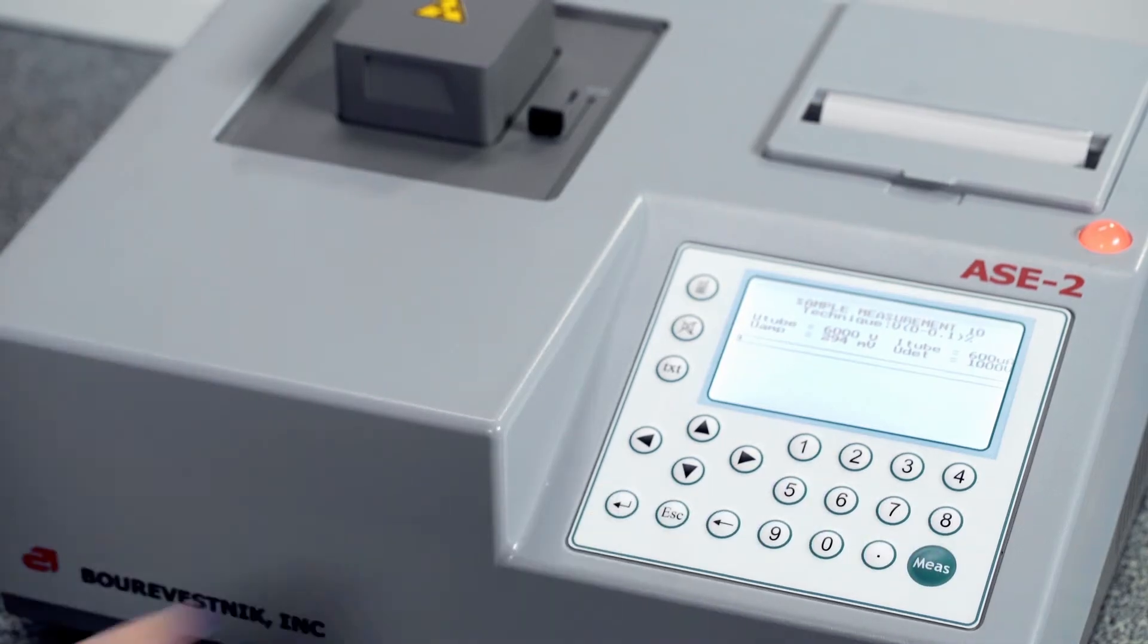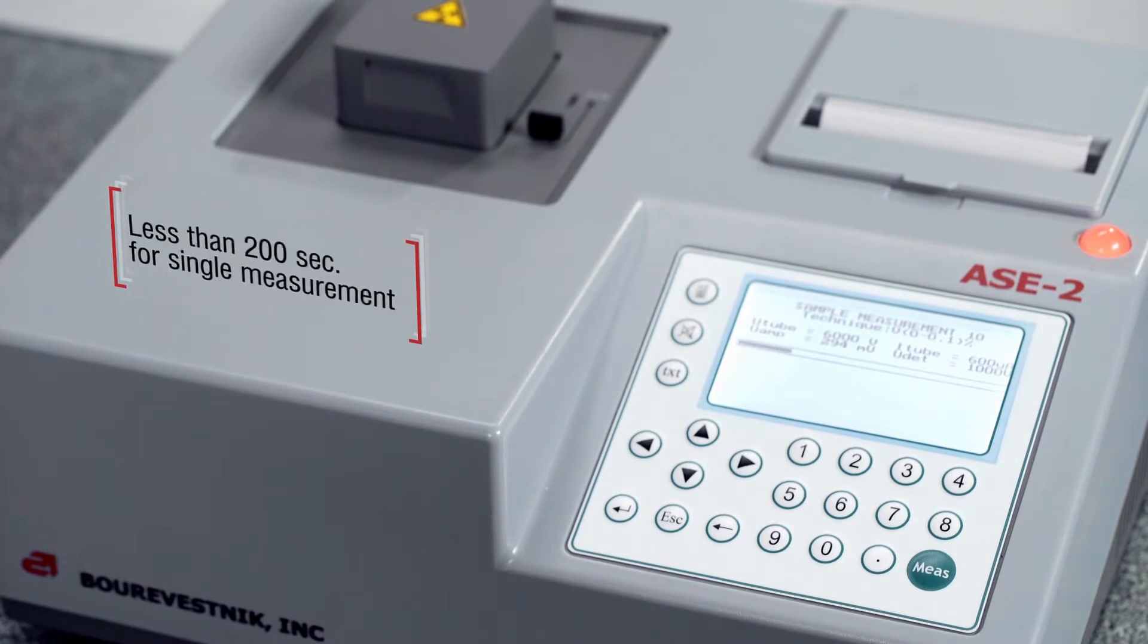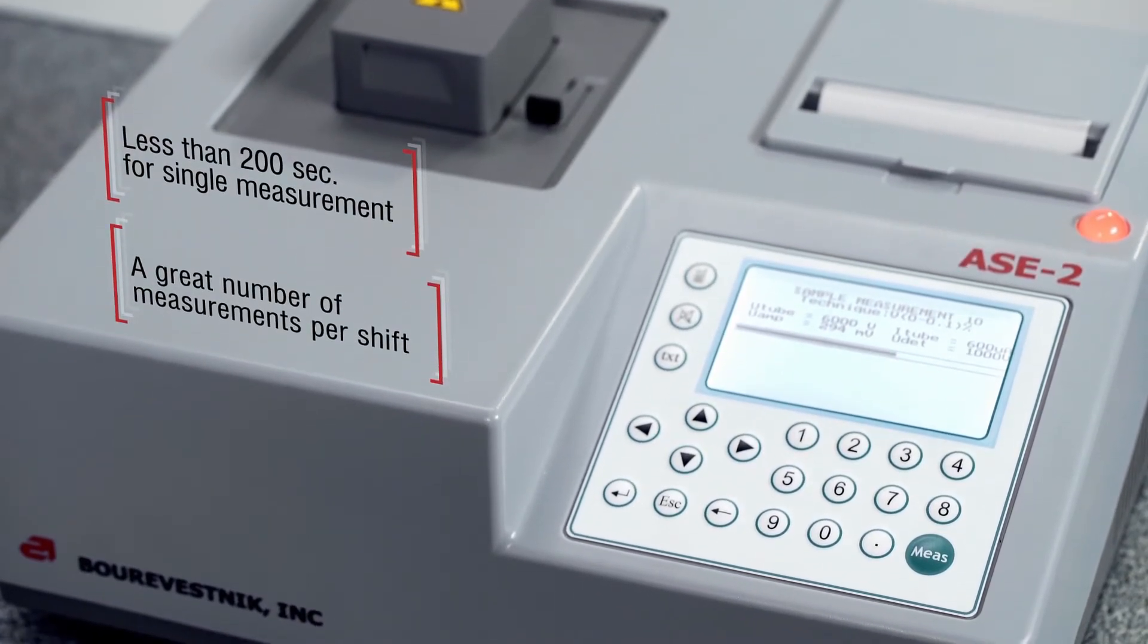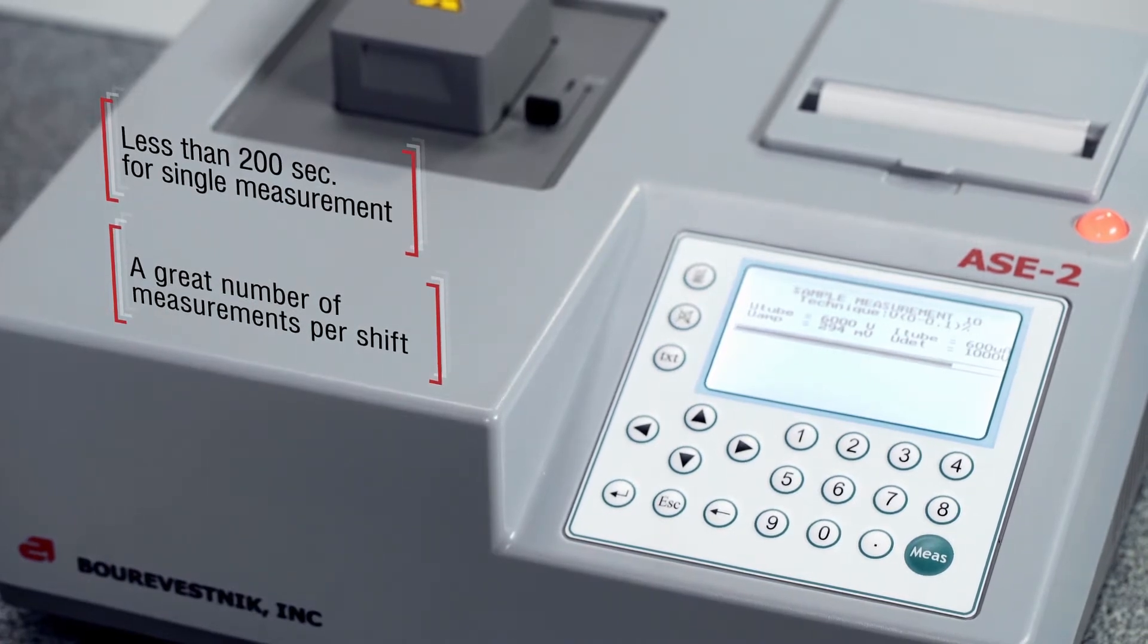The analyzer is controlled by means of a built-in keyboard. The measurement time is not more than 200 seconds, which allows a great number of measurements during a work shift.